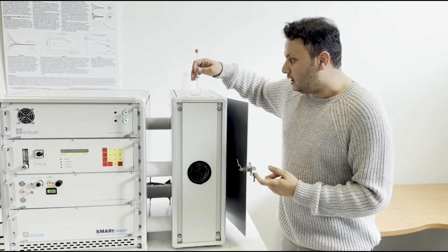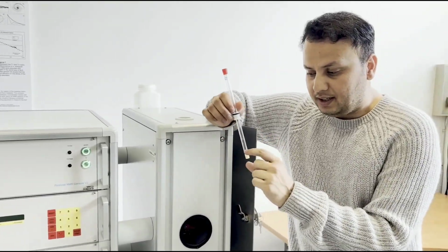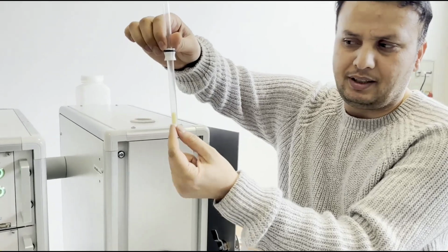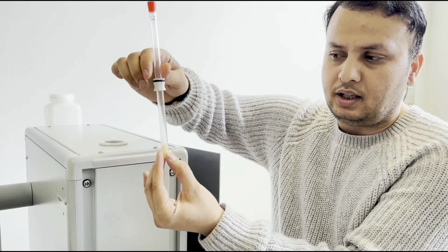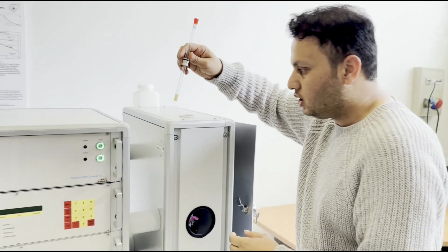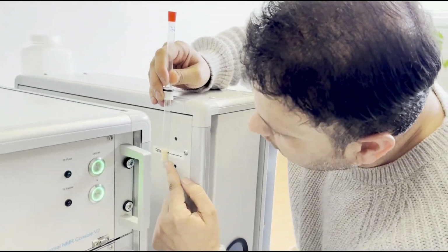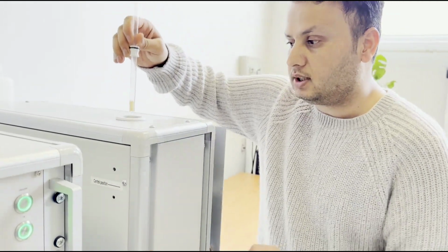Before starting an experiment, it is really important that the sample is correctly positioned inside this tube, and the volume should be in this range. This is the standard range which we use to perform NMR experiments on our sample. To correctly position it, you have a guidance line here. The sample has to be centered with this line, and then it has to be inserted here.